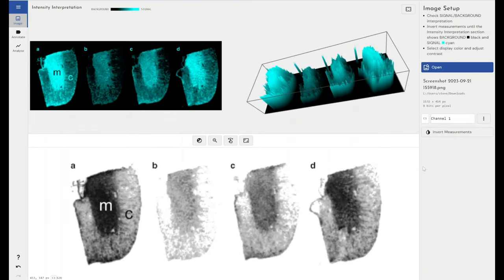Today I'm going to be running through one of the potential use cases of the Phoretics Toolbox image analysis software as compared to our other image analysis software options.